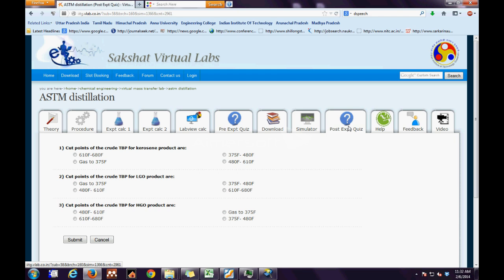The next is the post-experimental quiz. Similar to the pre-experimental quiz, the user has to make his choices and press the submit button.